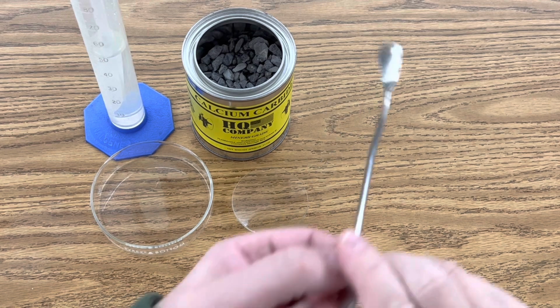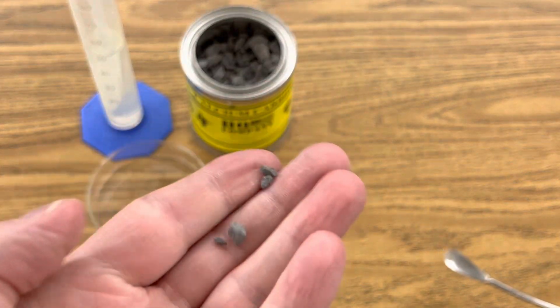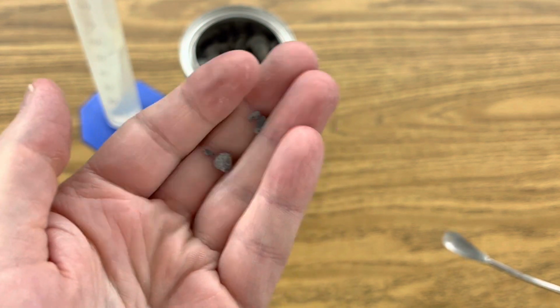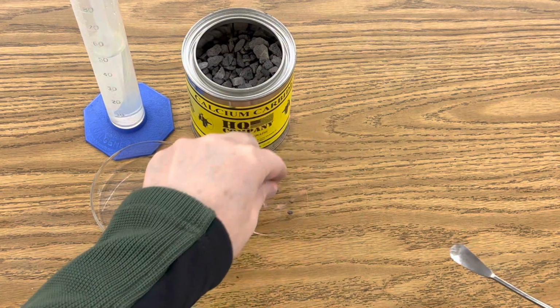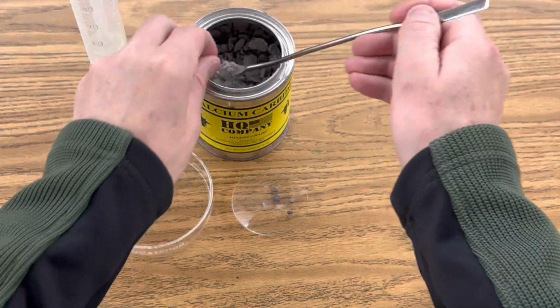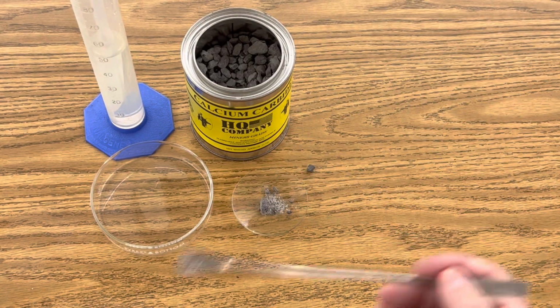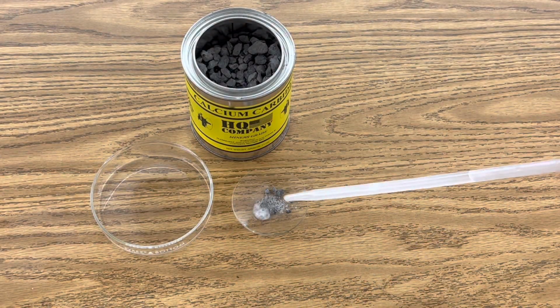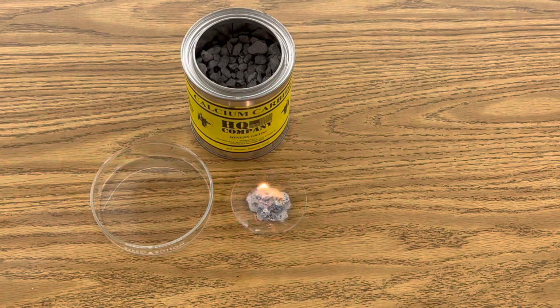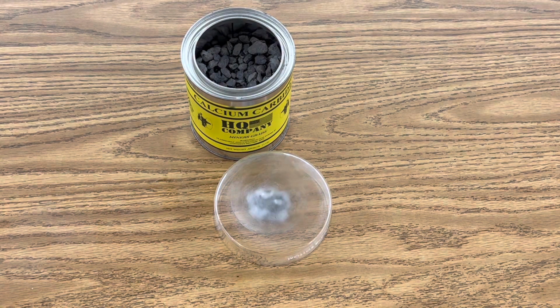So this is what your calcium carbide looks like. You can see it's just a couple of black stones. This is just a calcium with a couple carbons attached to it. Its formula is CaC2. And if we put a few chips on this watch glass here and just add a little bit of water to it, you'll see that acetylene gas released right away. There we go. And then you can easily put that out by covering it.